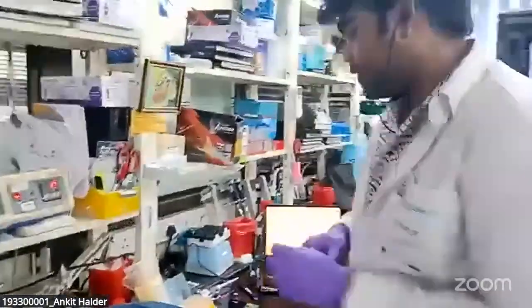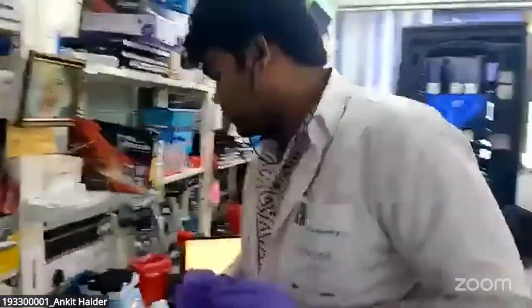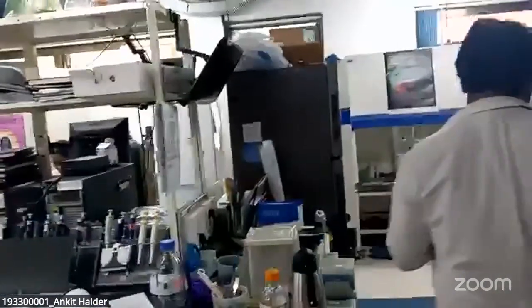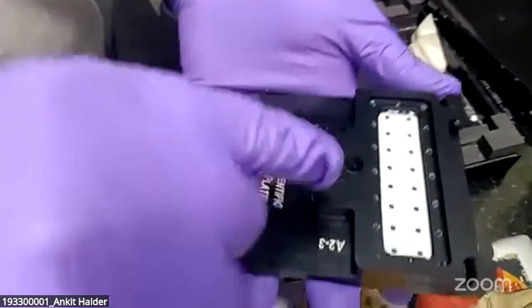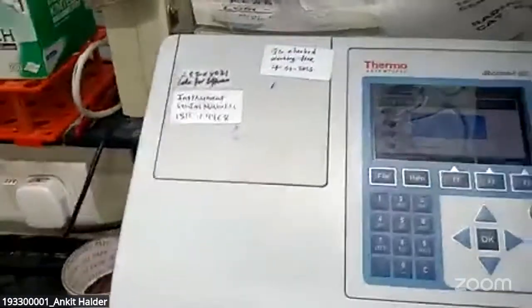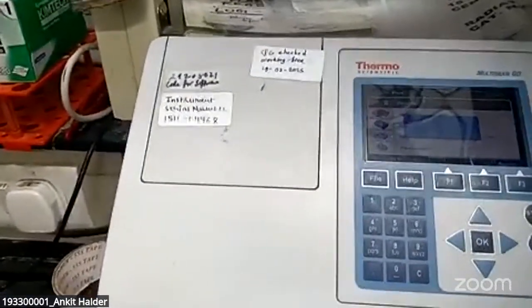Whenever you get the dried peptides, you need to resolubilize them with the FA, and after that, there is a particular micro droplet plate that I will show you. So this is the micro droplet plate. You can see we need to put the peptides in this micro droplet, and with the help of this instrument, we can easily find out the amount of peptide out there.